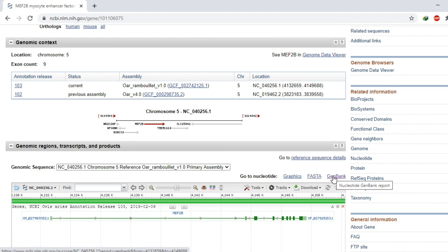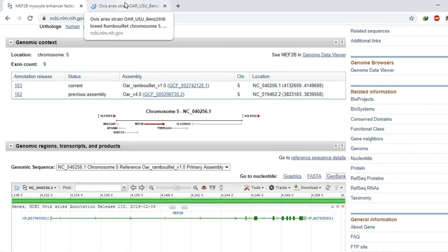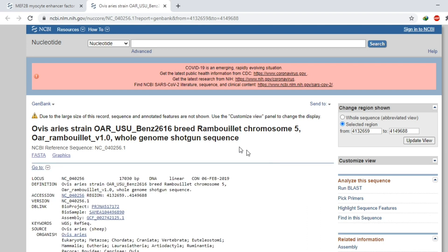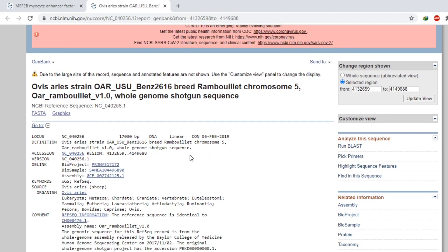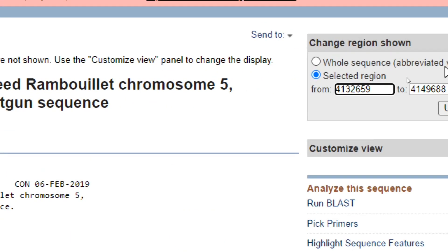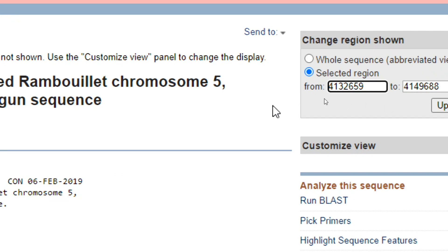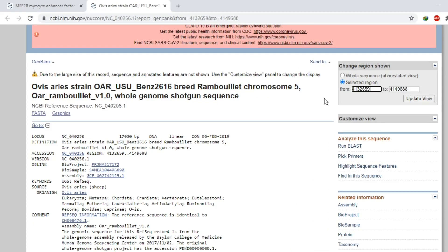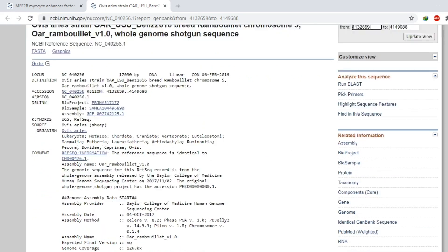Since we are interested in the sequence of this gene, we will click on GenBank and open it in a new tab. Here is the detail of our gene — this gene has a total region of 17,030 base pairs, and it starts from this region to this one.